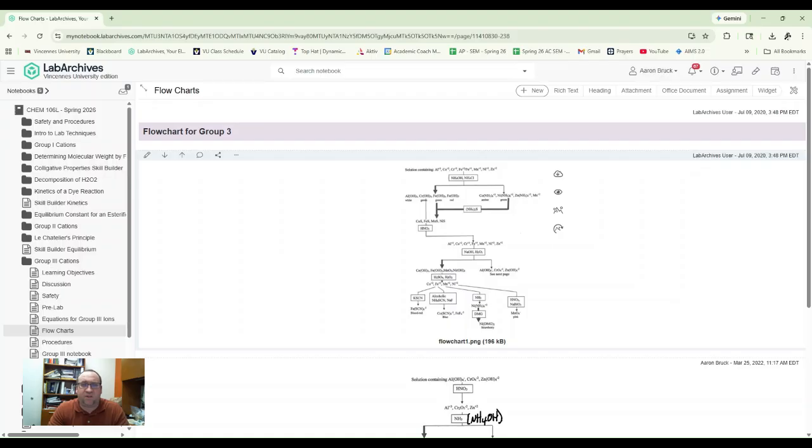The purpose of this video is to do a little bit of prep work for you to help you get ready for the Group 3 qualitative analysis lab. So in this qualitative analysis, this is the Group 3 analysis. This is the last qualitative analysis that we're going to do before we get into the general unknown, which is your lab practical final exam at the end of the semester.